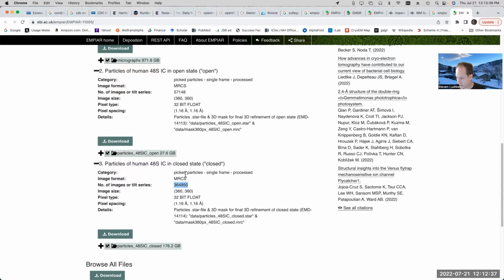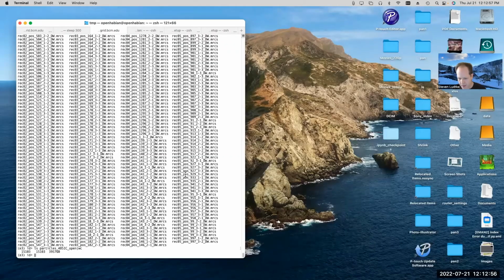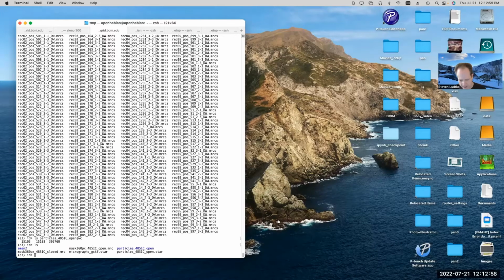I haven't looked at the raw micrographs to see whether that just means the data was really sparse, or whether that means that when they pre-processed and did the early classification, there was a lot of data they threw away. Now, if they threw away a lot of data, that would imply that probably if we want to do the GMM stuff, we should actually go back and kind of pick the particles ourselves. But I'm not sure if I want to tackle that for this group or not.